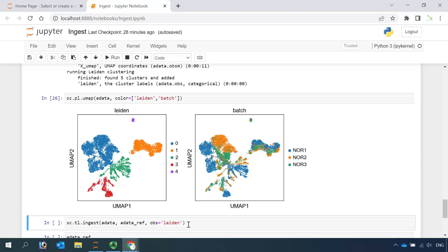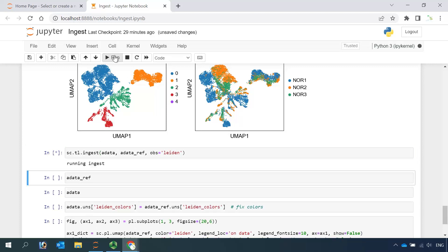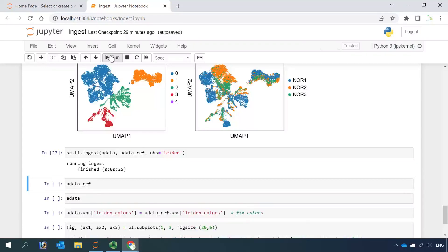Now we can use the ingest function to map the new dataset to our reference dataset. We know from both datasets the observation for the cell clusters is Leiden clusters. So let's run the ingest function. In the ingest function, we map the new data to the annotated reference dataset.